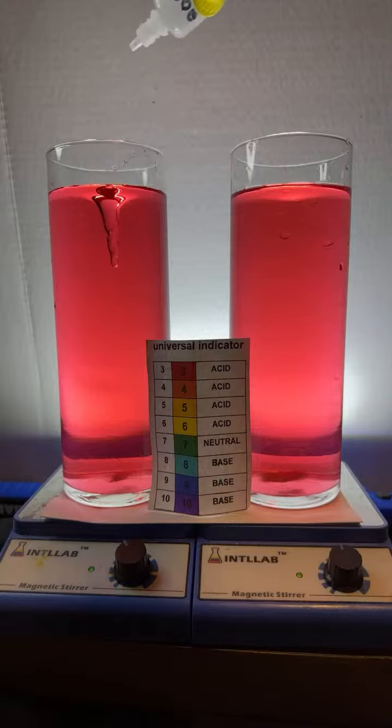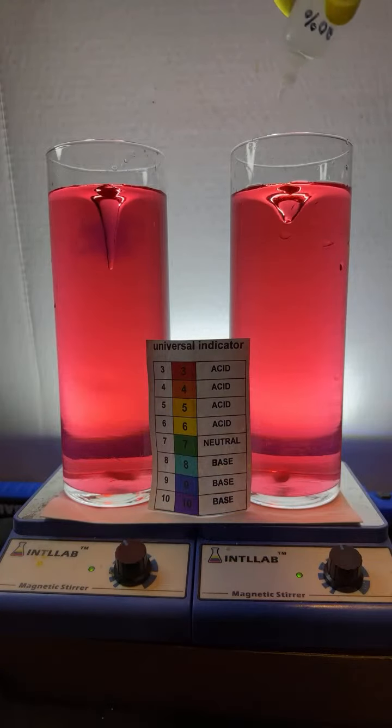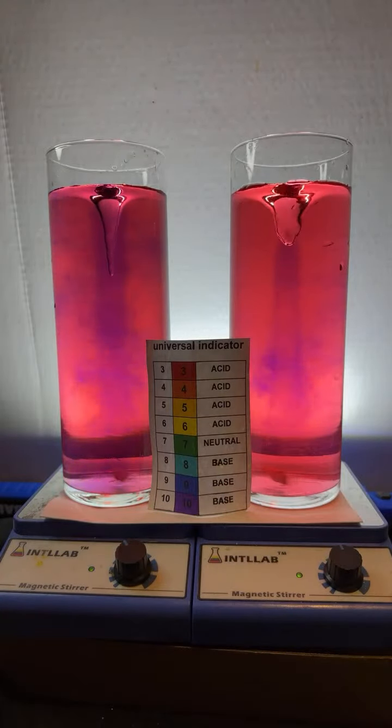I'm going to add some. Now we're at low pH. I'm going to add some base here to both sides to get some color change going on.